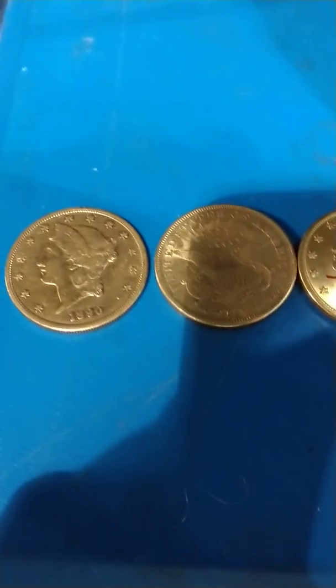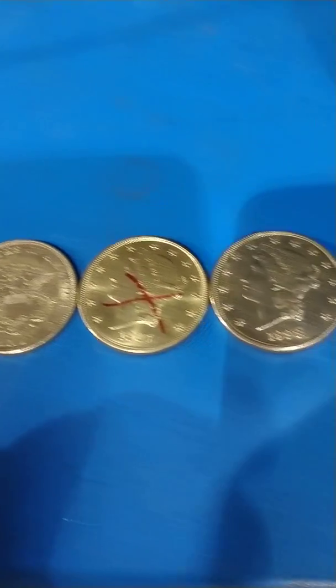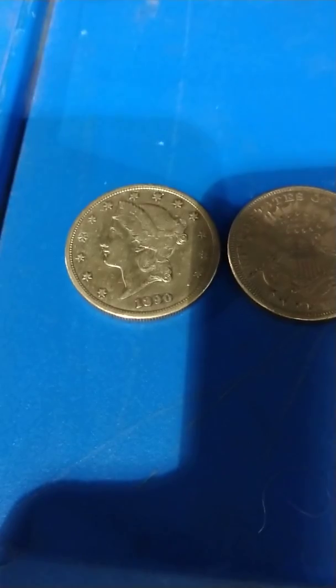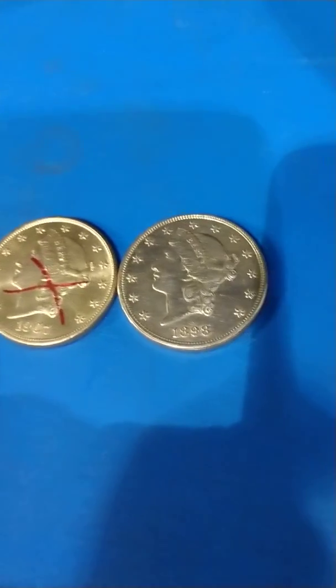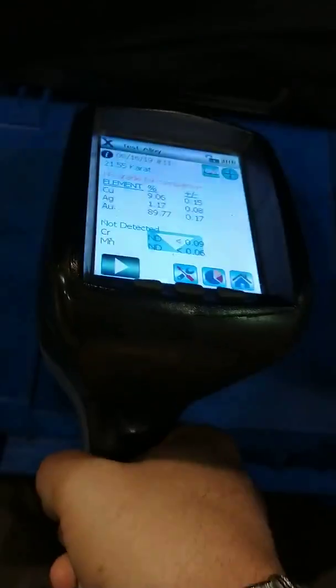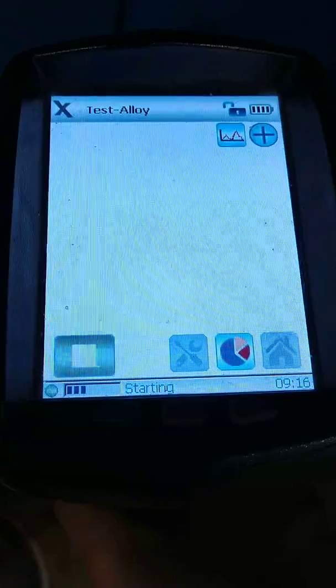This video is to demonstrate identification of counterfeit coins with an X-ray spectrometer. We have four double eagles here and they look pretty good — one looks a little funny. What we're going to do is take an X-ray spectrometer, put it on the first coin, and pull the trigger.